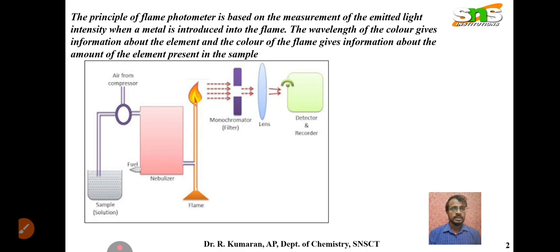It means color tells what element is present, and also how much quantity. That's why it says the amount of element present in the given sample solution.